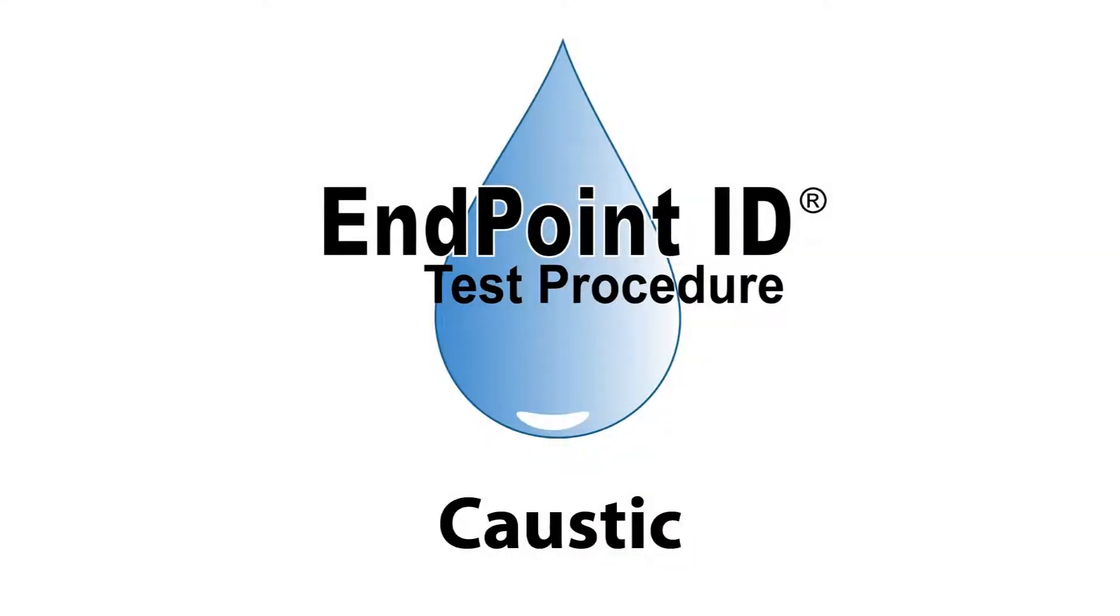This is a demonstration of the Caustic Series Drop Count Test Kit using Endpoint ID procedures. Please refer to the appropriate Endpoint ID Plus instruction sheet while watching this training video.